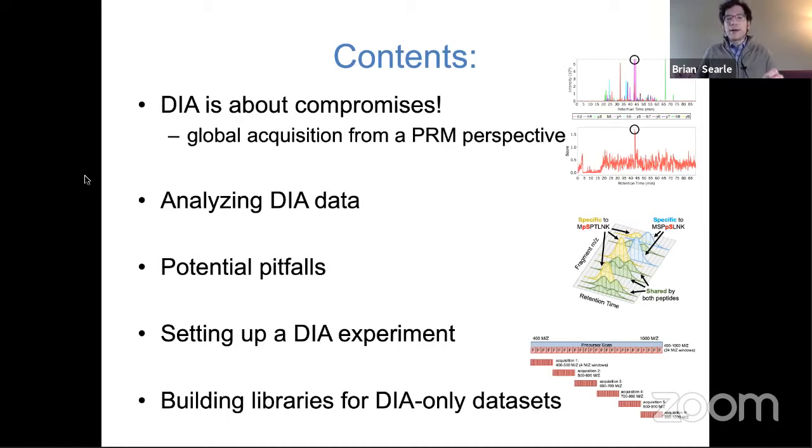That said, because they're both beam type methods, using HCD, you actually get very good, close fragmentation to what you would typically get in another type of beam type instrument like a QTOF. That said, if you were collecting in CID mode in an Orbitrap, you would not get very good spectrum quality or comparisons in the same way. So the Prosit predictions work really well for the QTOF. That said, they are accurate only to a degree. They're good, but they're not perfect.